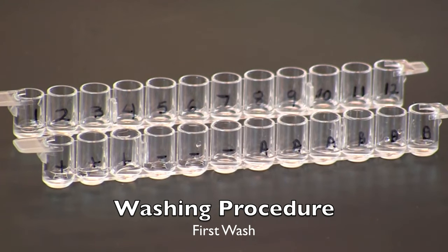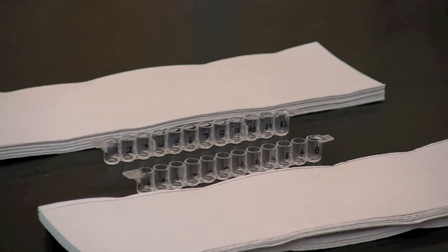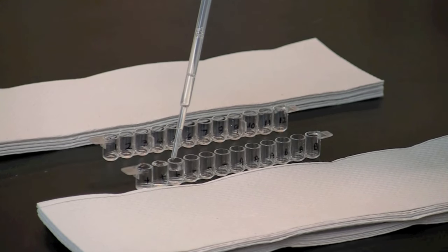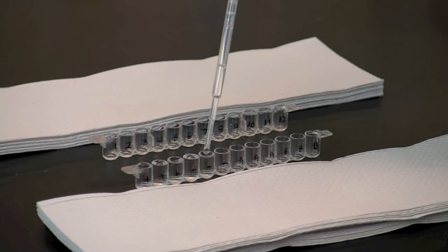The following steps will take you through the procedure for washing the microplate strips with wash buffer. Use a transfer pipette to fill each well with wash buffer, taking care not to spill over into neighboring wells. The same transfer pipette can be used for all washing steps in this activity.